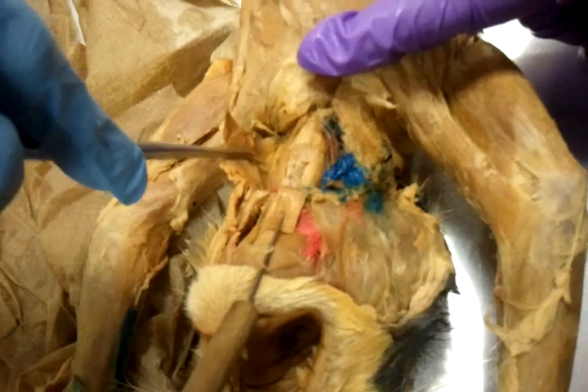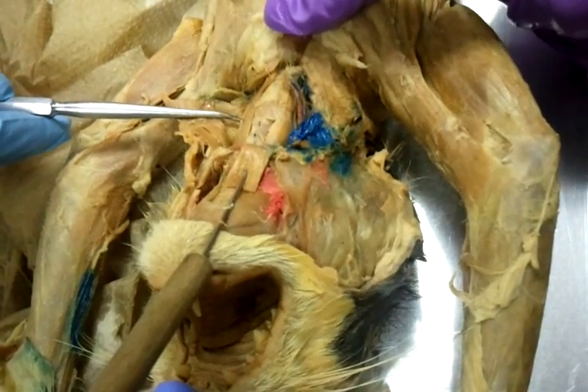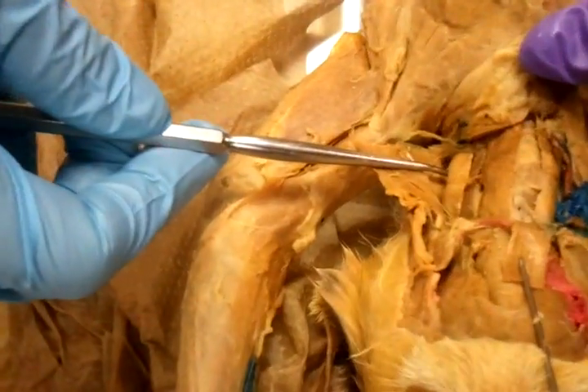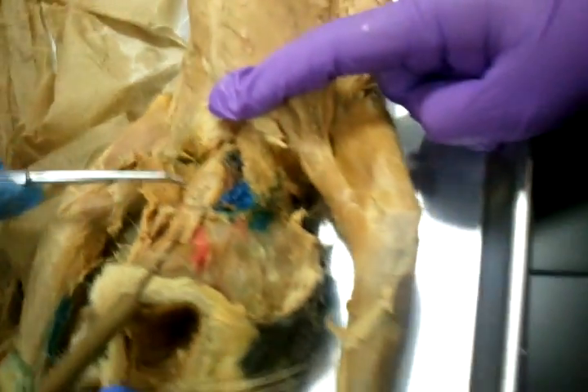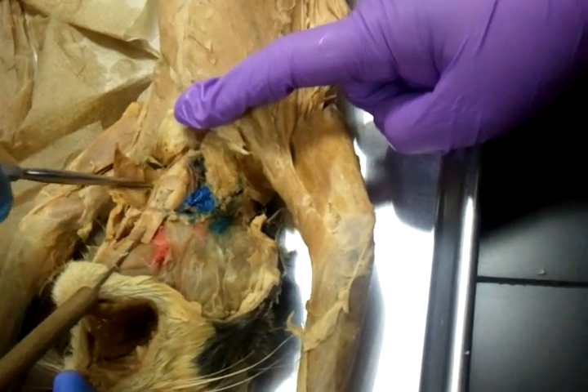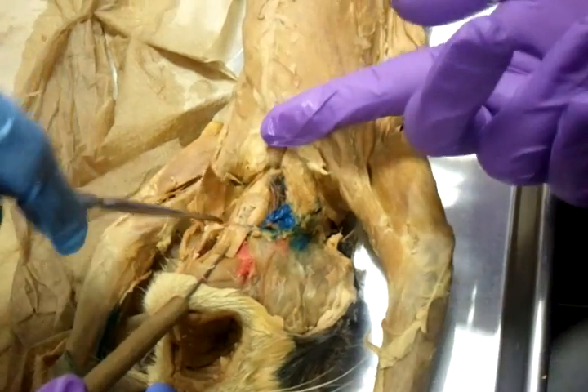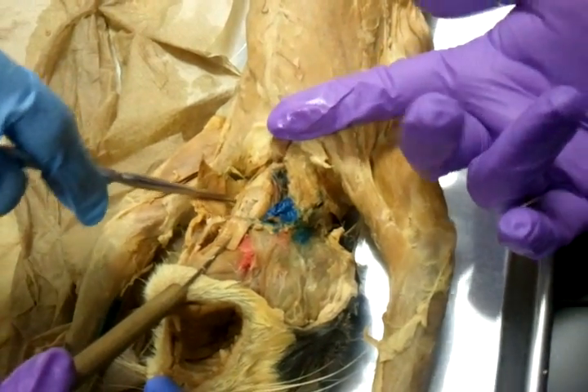And here, very deep to your sternomastoid, the cats have the cleidomastoid. Are we going to have to know that for our test? We don't have that one — it's on the list, but I said not to, because somebody took it off, so you don't have it.